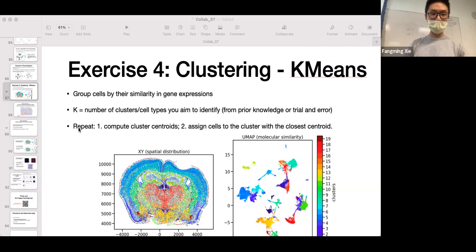Okay, and replot this heat map. So this heat map is useful in some ways, but not in highlighting the differences across cell types. So let's try to replot it by replacing it with the z-scored centroid. Okay. Oh, not defined. So I might have some typo. Z-scored. Okay.